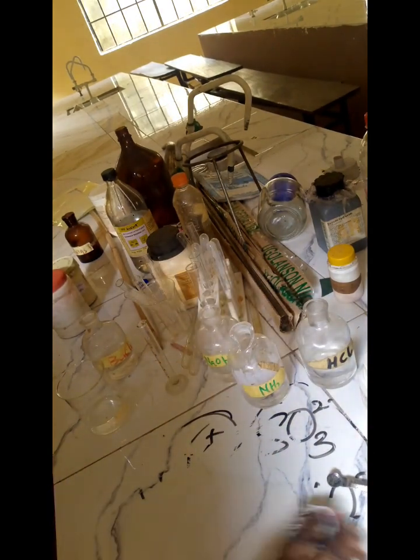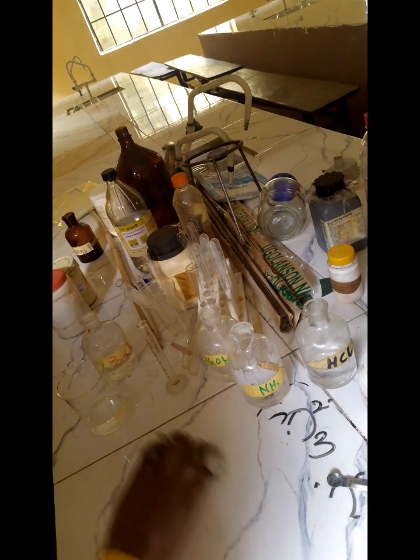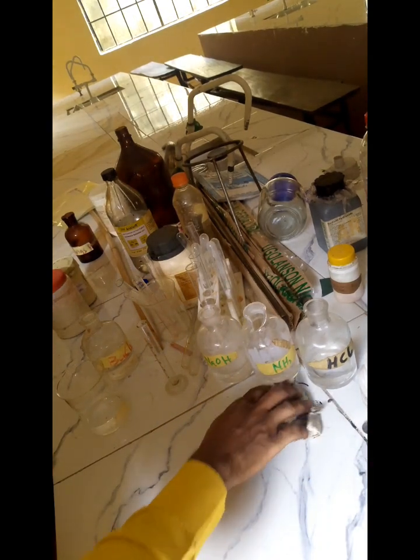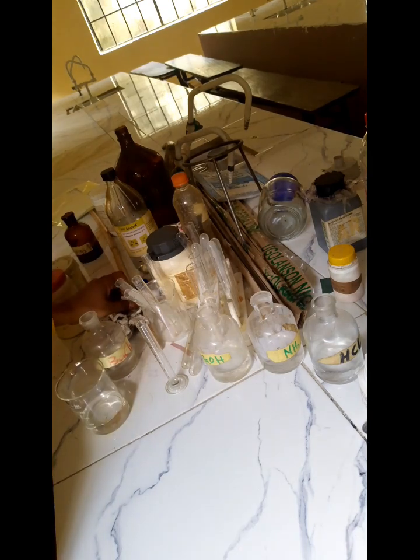So after barium chloride, the sample dissolved. In that case, since it dissolved, we'll simply report that SO3 is present because it did not dissolve with the effervescence process. All right, to the third sample.